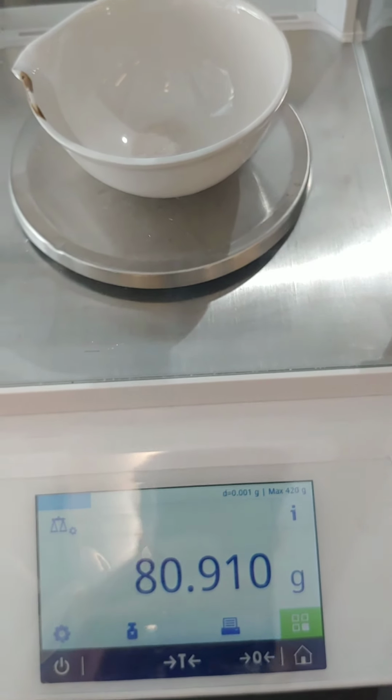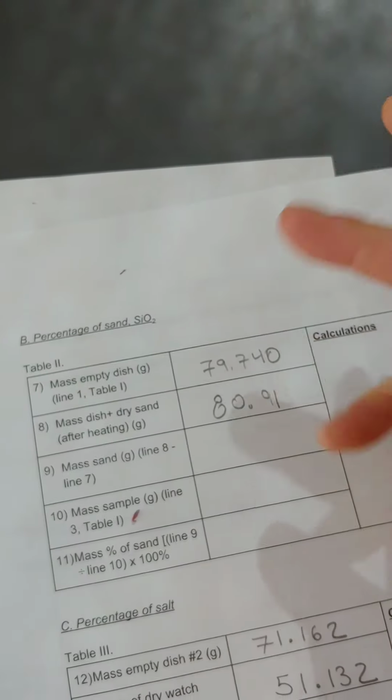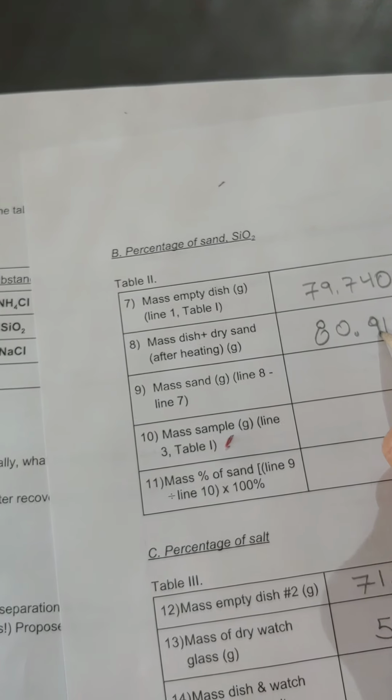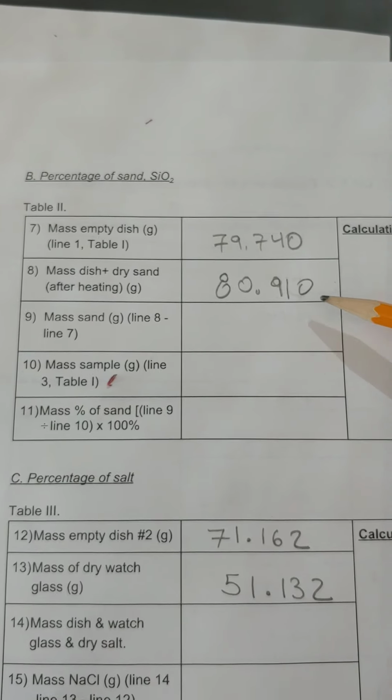But we can change our data then and write that value and say 80.91, right? This is why pencils come with erasers. This is why we do labs in pencils. There is the mass of our dish and dry sand.